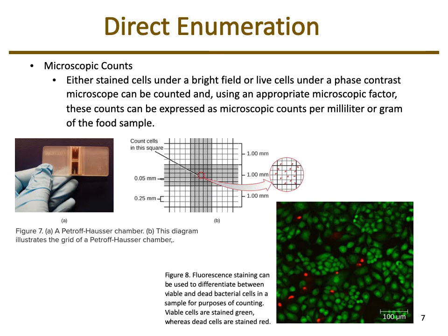So in the figures you can see an example, the counting chamber that's utilized. It has a grid, and when you pipette in your sample, what falls in those boxes is a set volume, so you can then go back and take your counts and calculate the concentration of the microbes that are present. And because you started with a certain volume or certain weight of material, you'd be able to determine whether your microbial counts are too high or too low. And again, with different food products, there's a certain standard in the number of microbes that are allowed. You can also use fluorescent staining.